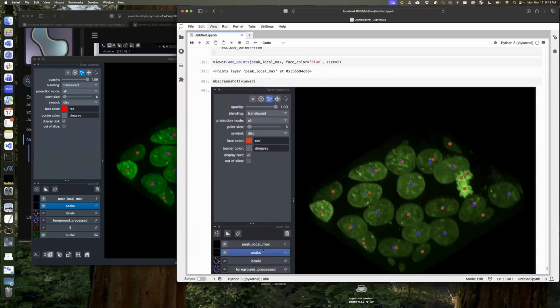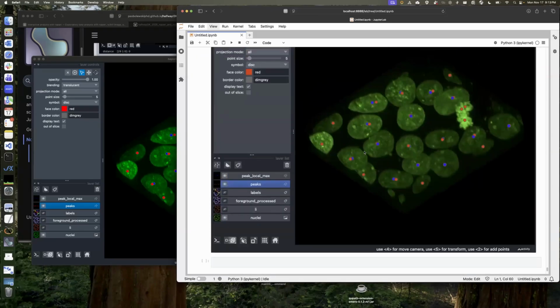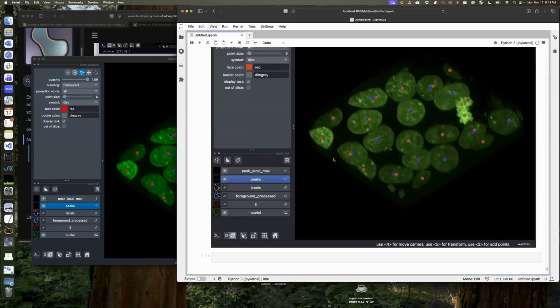I could have provided a more descriptive name, like name equals smooth EDT. In my experience, that's proven to be really powerful, to be able to document a process and go back and explain why I chose certain parameters and why I did certain things. So I think that's really nice.